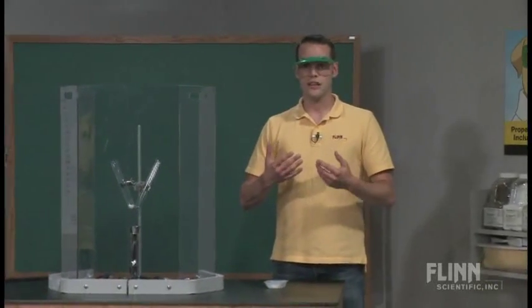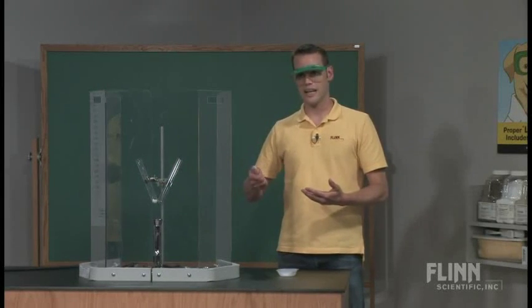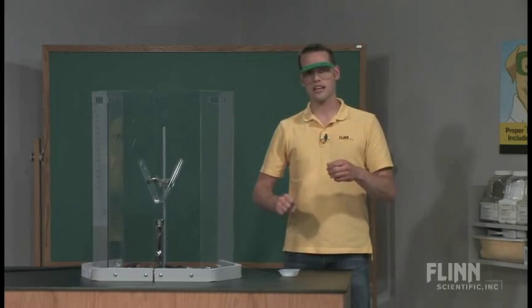When I do this in my classroom, I have a fume hood. I put it in the fume hood. This entire setup we have set here is because we don't have access to a fume hood in the filming studio. But in the fume hood, I have this reaction set up. I have a gas line that does run into my fume hood, and I heat it up inside of the fume hood. As soon as I drop the candies in, I pull the sash down and I step away.